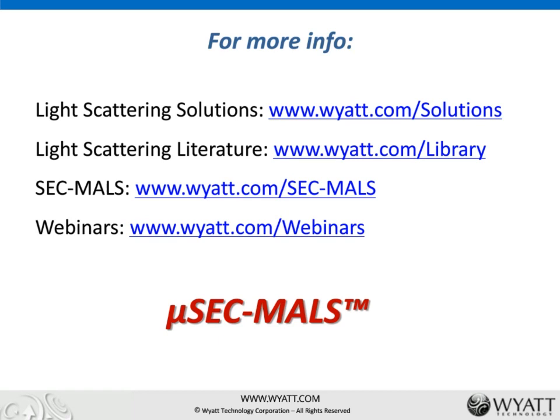The first question maybe goes to something you mentioned right at the end there. We have someone asking, it seems that microDAWN is a lot more sensitive compared to the Helios 2. Is there a way to use microDAWN in standard LC runs?